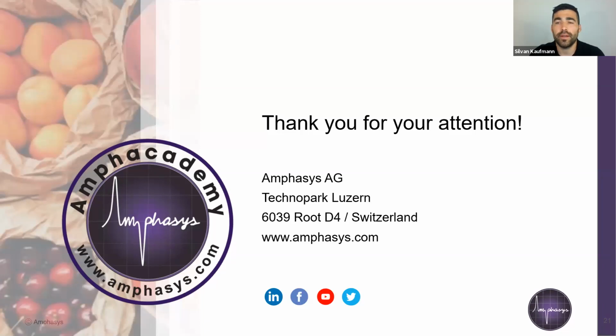We had quite a bunch of questions related to pollen quantification. In your talk, you showed bagged spikes in the field and also indoor. Which setup would you recommend? If you want to work with paper bags, then I would highly recommend doing it inside, or in general it depends on the location where you are. If you don't have any problems with condensation during the night, so high humidity or rainfall, then you can of course do it outside. But if you have these problems, then you should go inside.